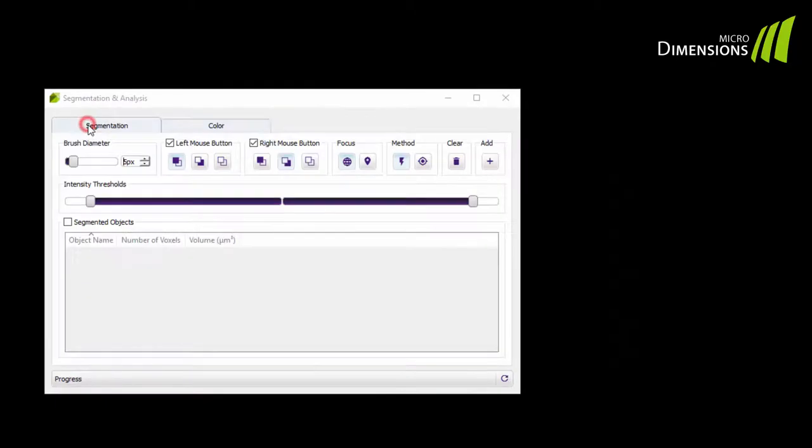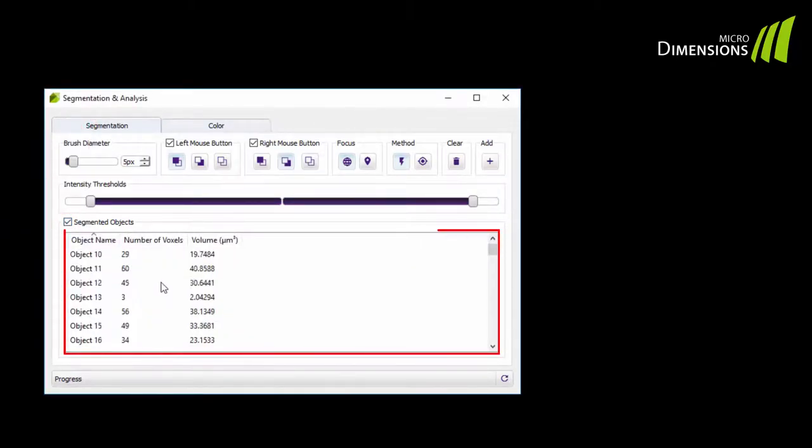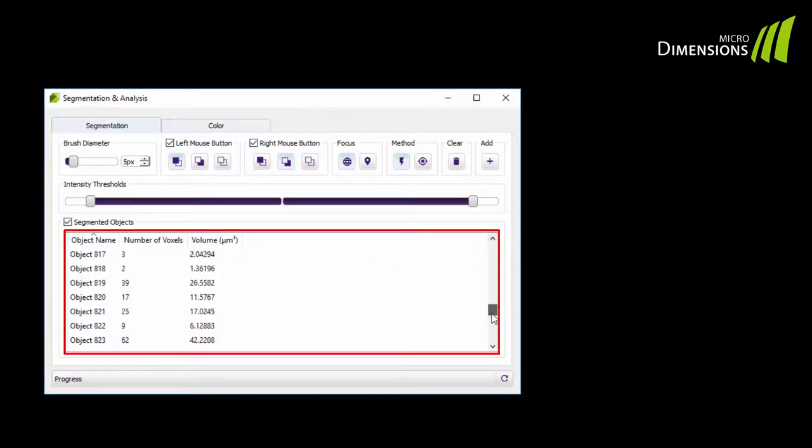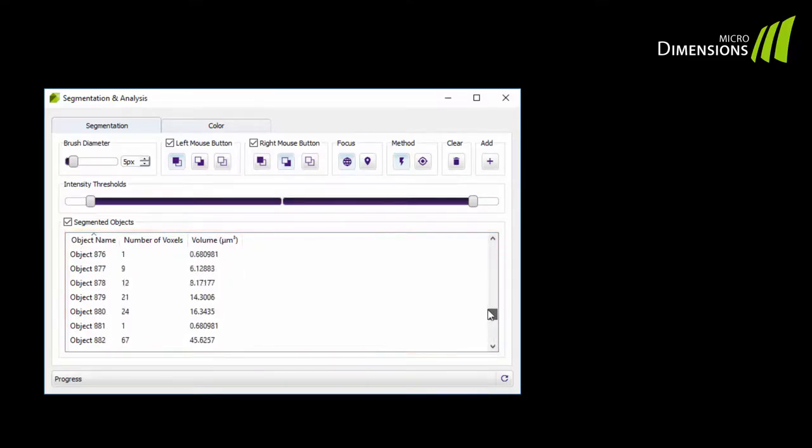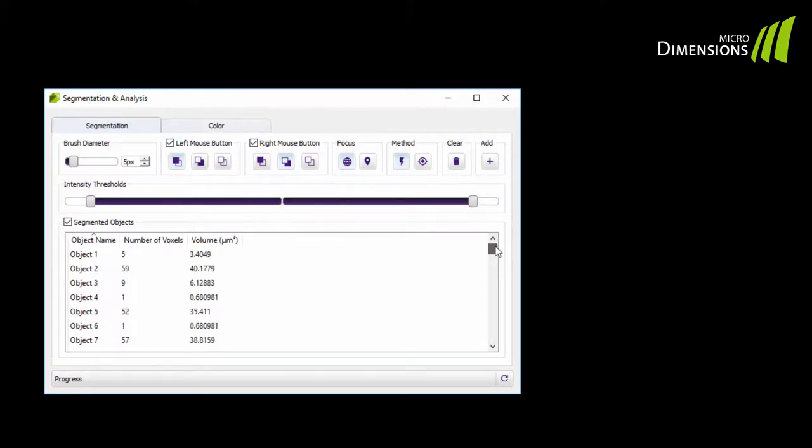Just tick the checkbox to count the number of nuclei in your dataset. In the analysis window you will see the results of your analysis.